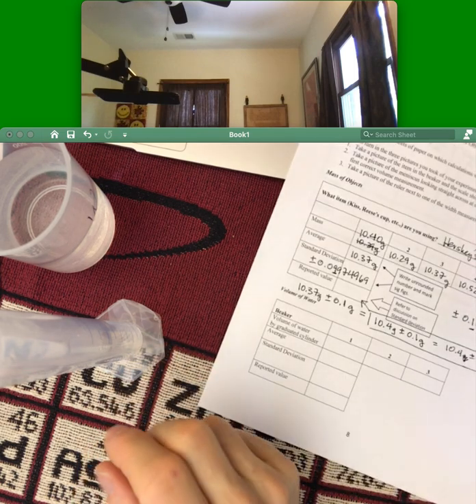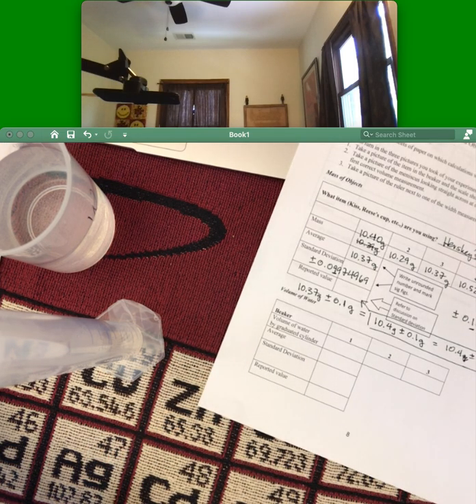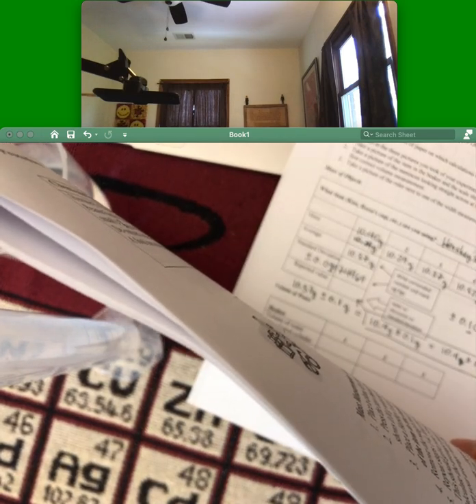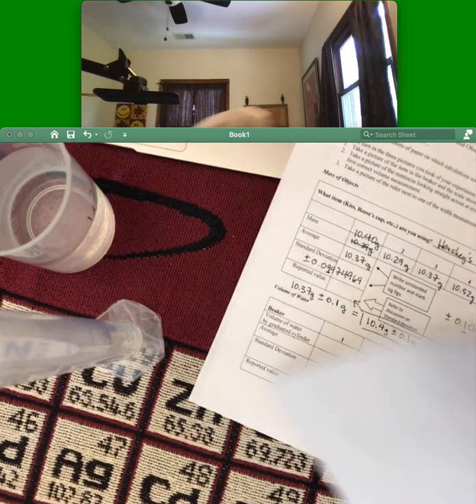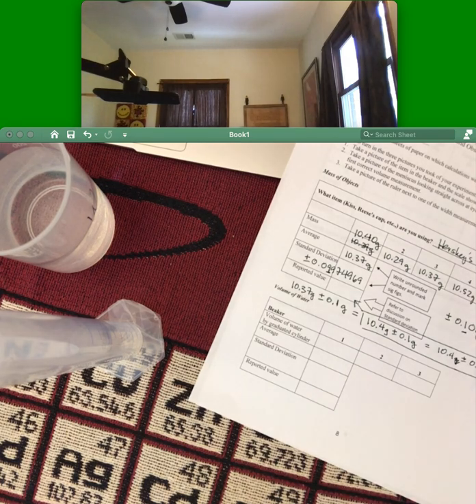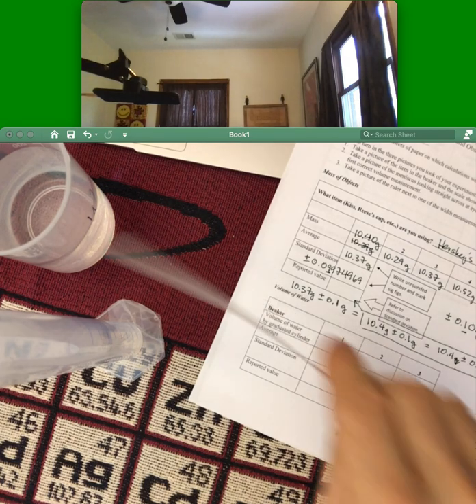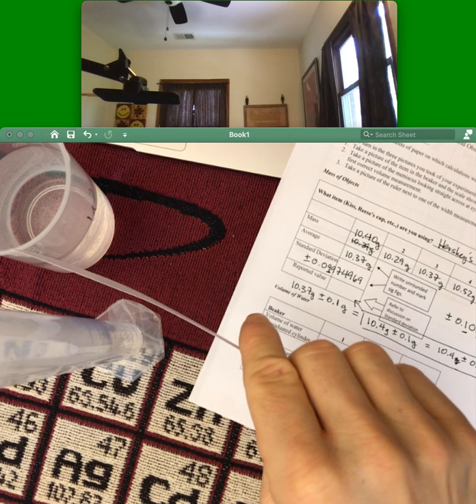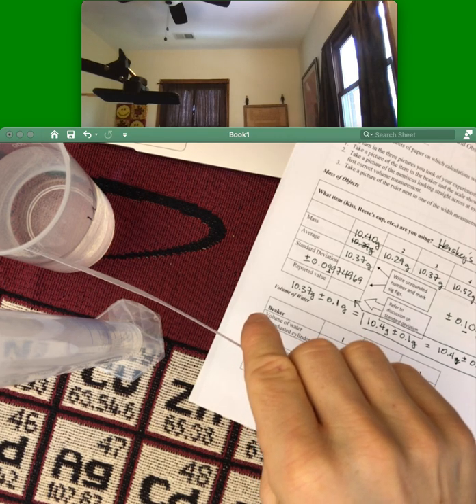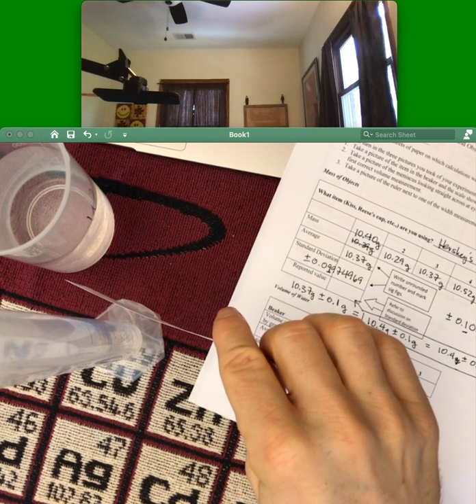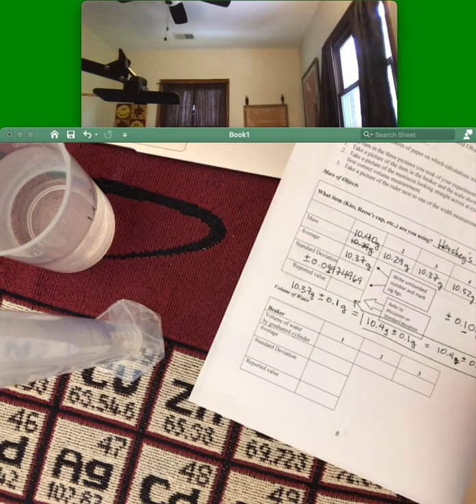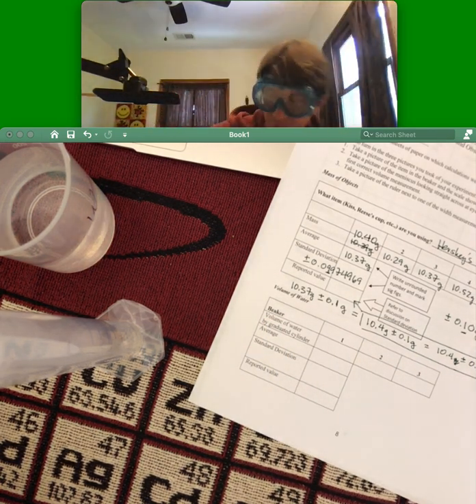And so I am reading it to the 0.1 milliliter. I am going to even put a little piece of white paper behind it. So that doesn't help at all. I am actually going to put my ruler behind it. There is 25, 26, 27. It is less than 27. Actually, it is 26.9 for mine.